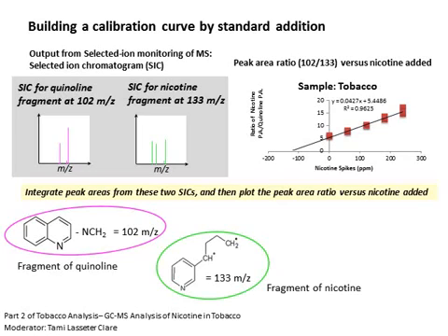Remember that it is very important to get good data from your sample before adding any spikes. I recommend doing 2 to 3 GCMS runs of your sample. Note that each run takes about 10 minutes, and so you won't have time for more than about 3 replicates of your samples. And you should also take replicate measurements of each spike.